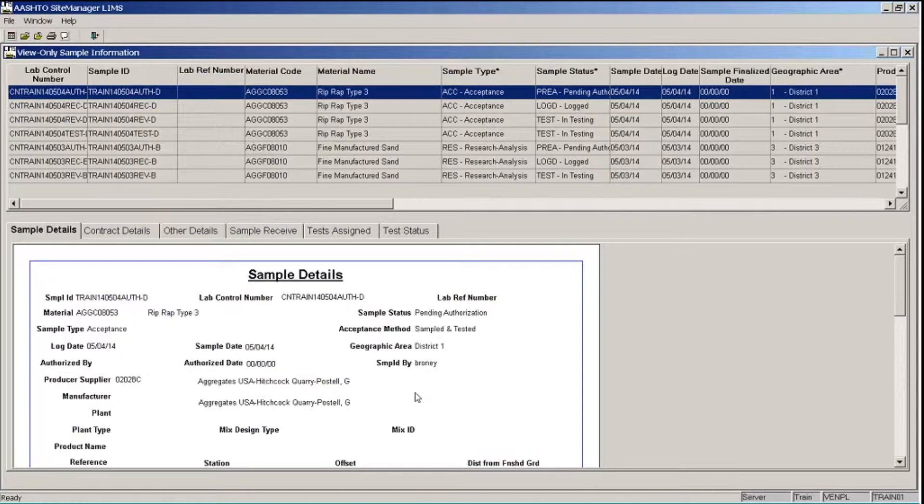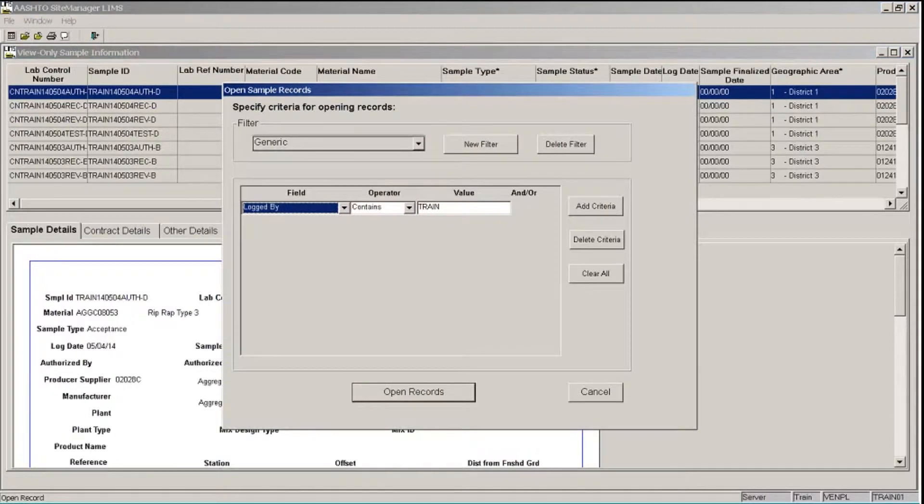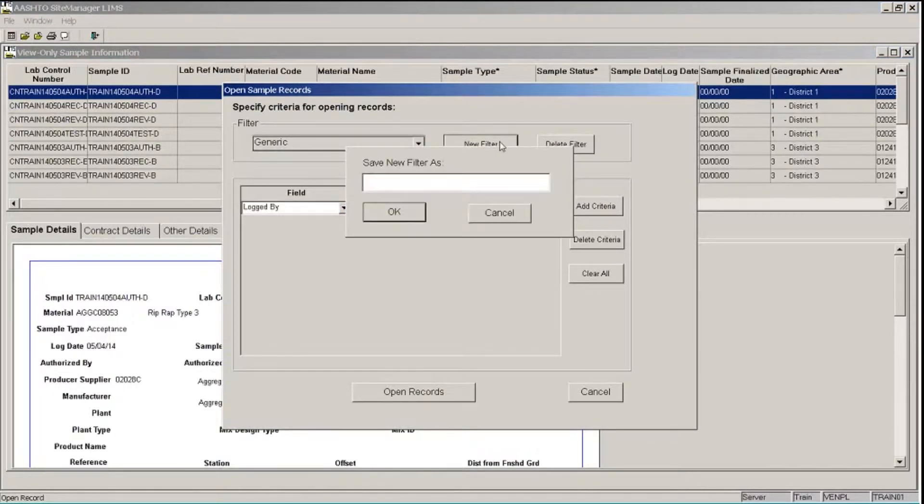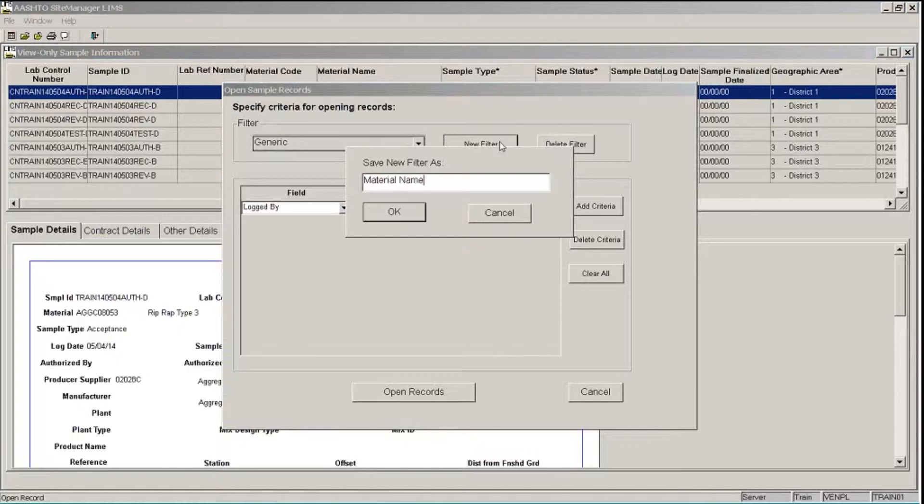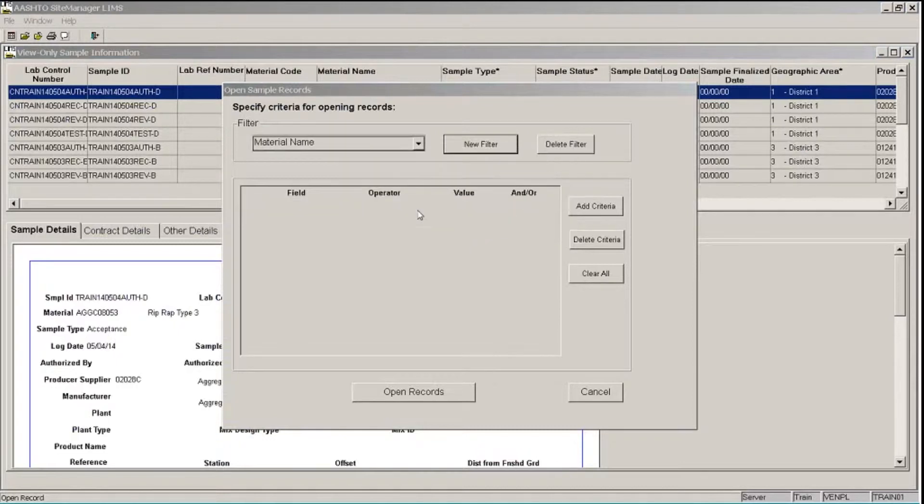Now you can also create and save filters for frequently used search criteria. So let's do that now. I'm going to click the Open button on the toolbar. And I'm going to click the New Filter button, which will bring up a box for us to define a name for our new filter that we're going to save. I'll type Material Name and click the OK button.